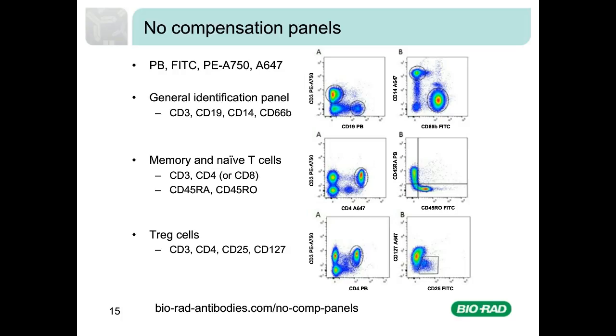It also includes B-cell populations, such as class-switched, memory, and naive, and finally, NK cell and myeloid cell populations. These panels are useful both in identification of common blood cells or as a starting point for building your own panels, where markers can be switched or extra markers added to suit your experiments.